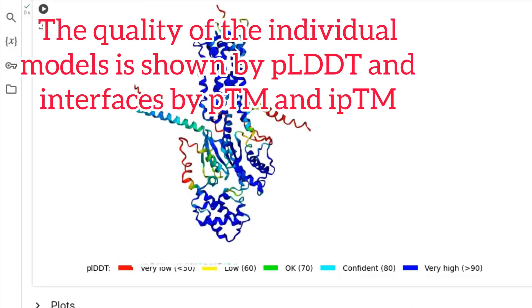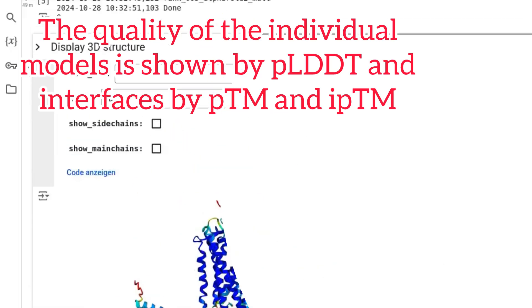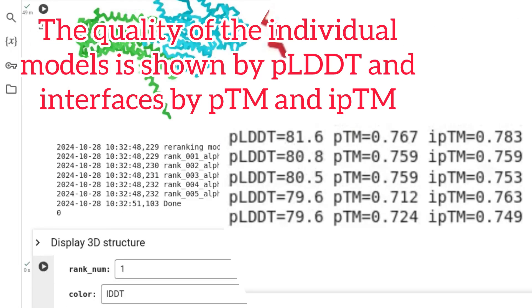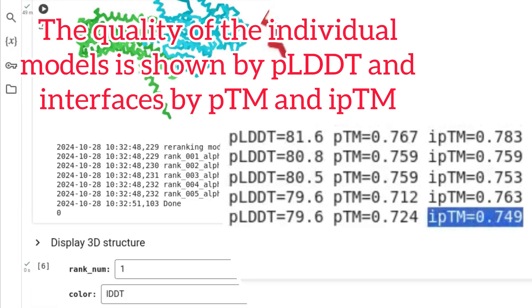The quality of the individual models is shown by pLDDT and interfaces by pTM and ipTM.